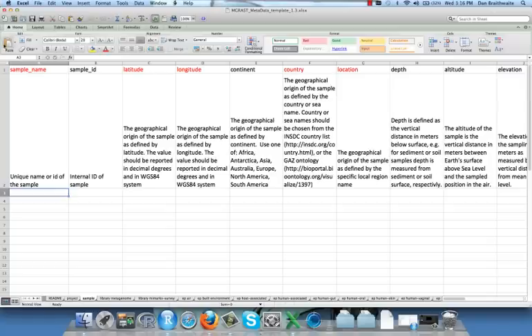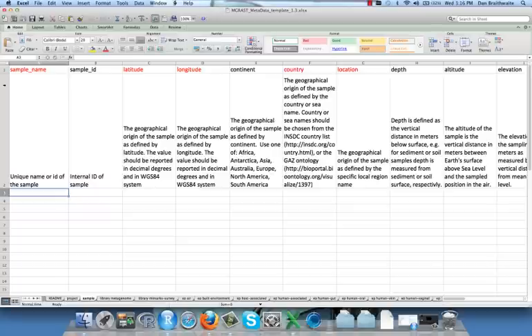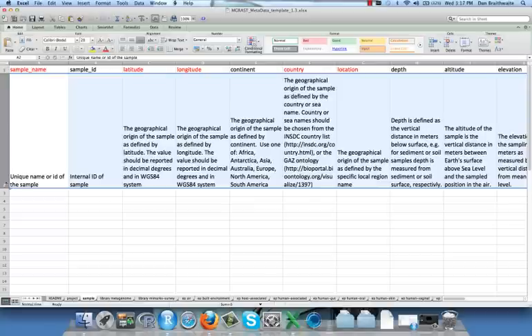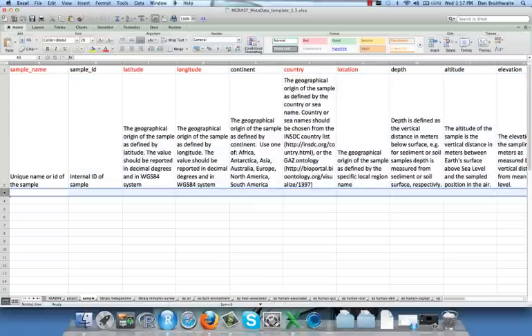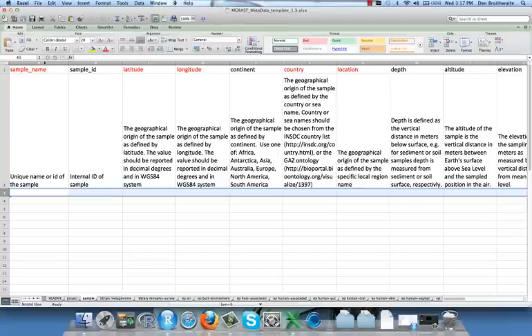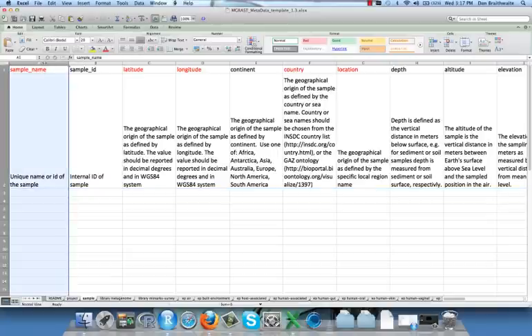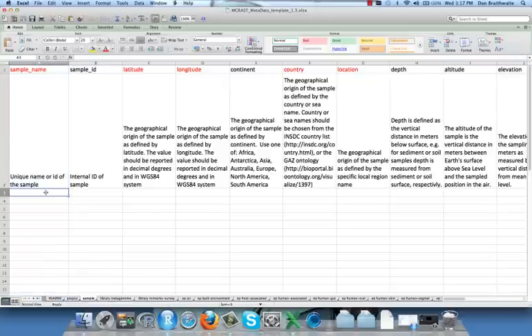On the SAMPLE sheet, now shown, you must fill one or more rows reflecting your experimental design and sequence files. Look at the second row carefully because it explains what values or formats are permitted for your entries. You should complete one row for each experimental sample represented by the sequence files of your job submission.